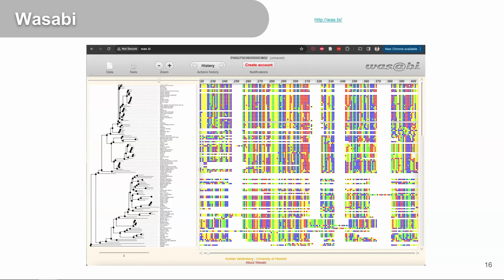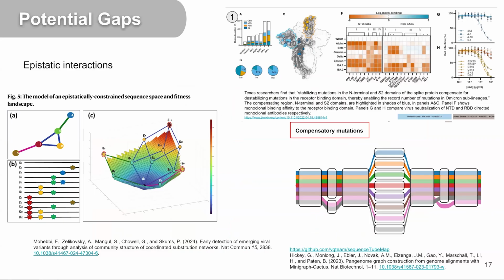This is a tool that's very obscure. It's from a Helsinki University master's thesis, but it was quite a number of years ago. It was one of the first to support dynamic scaling for very large trees, and you can zoom way out. And it has a coordinated view, it has good interactivity for selecting columns and things.